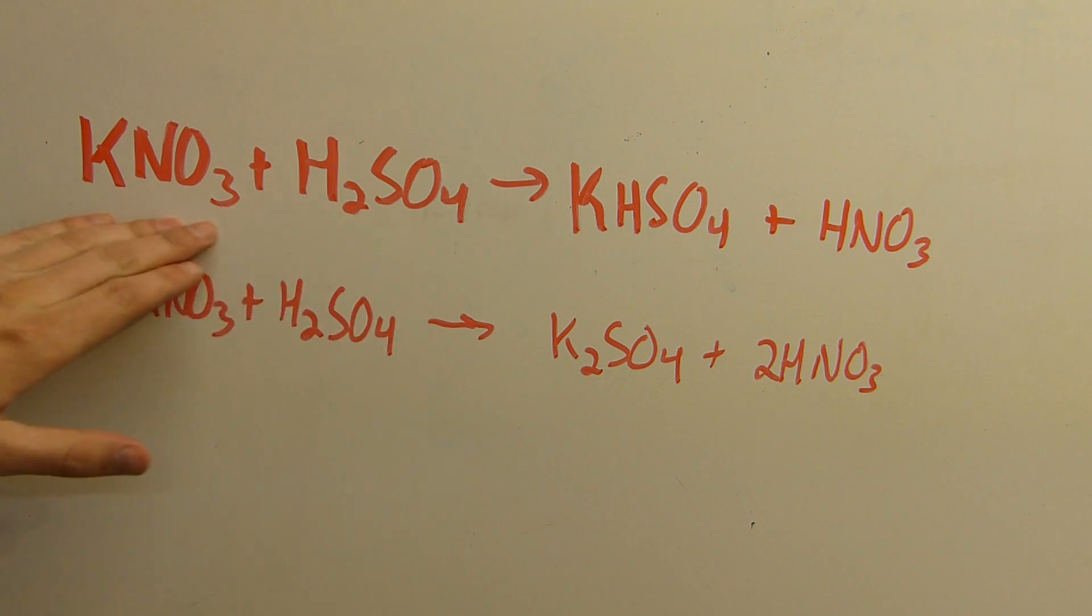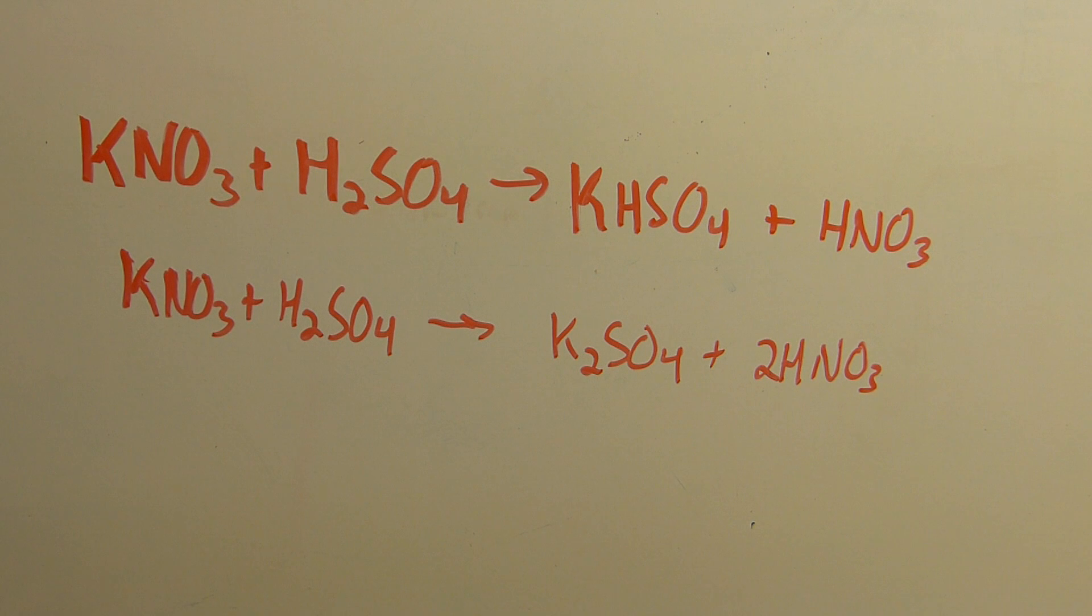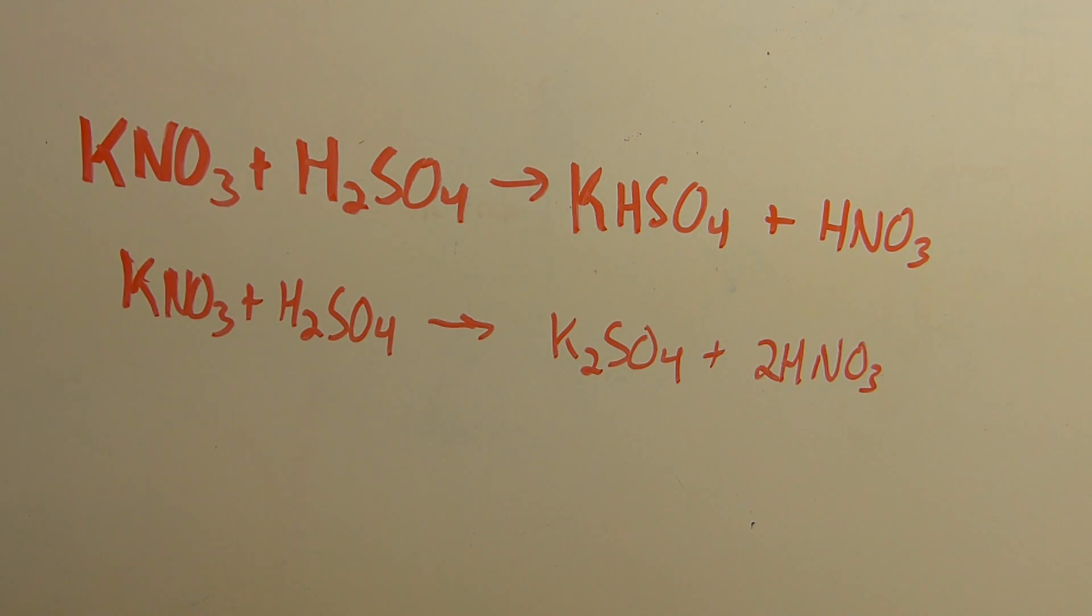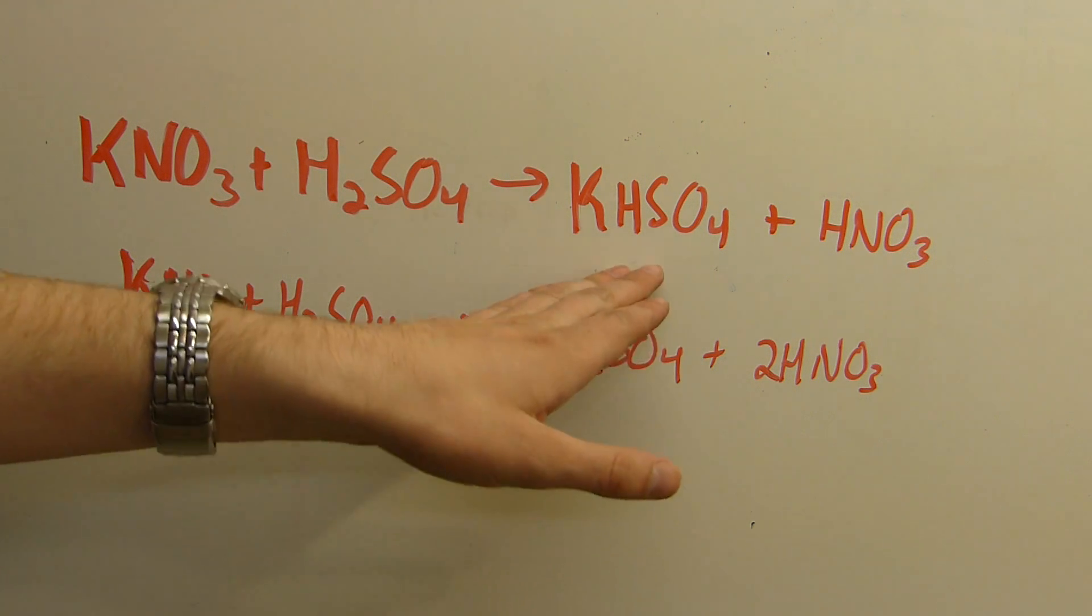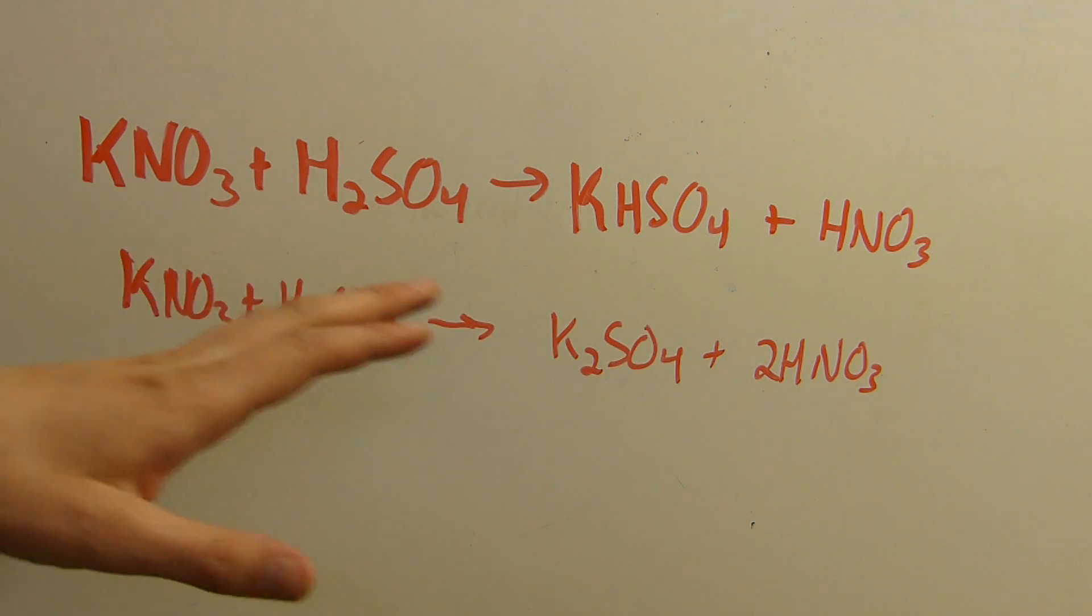So, I don't really mind adding water to the start of this reaction to ensure that I get the maximum recovery of nitric acid. Because remember, water and nitric acid form an azeotrope, and they will carry over together during the distillation. So, to start, I add about nine moles of water to this side of the reaction, and then when I'm distilling off the nitric acid, a lot of that water comes with. Now, eventually the reactants will get so thick in the boiling pot that they begin to foam up, and you obviously don't want the foam to be reaching the condenser or anything because that makes a huge mess. I've broken a lot of glass that way because of deposited potassium bisulfate getting stuck in the joints. So, at that point, the reaction is stopped, and everything is left to cool down, and you're left with almost pure potassium bisulfate.